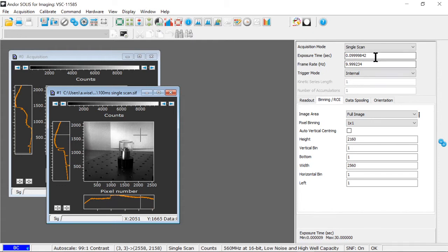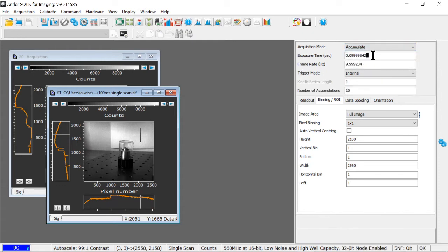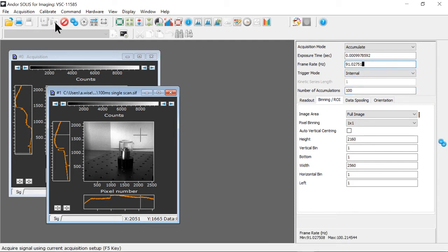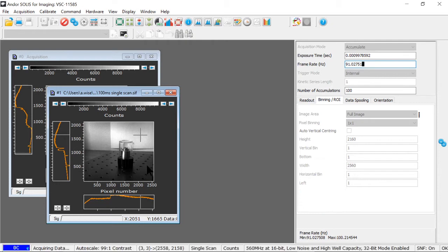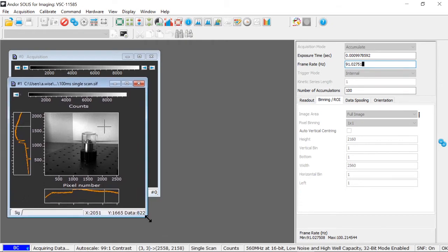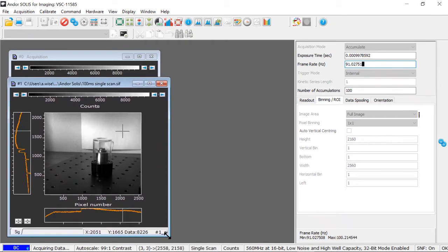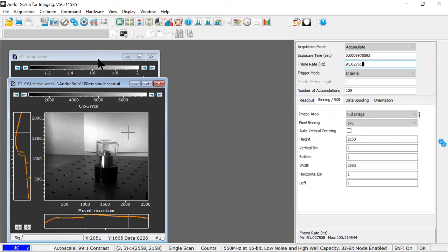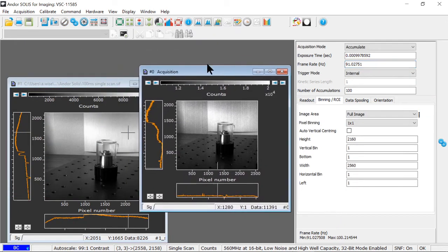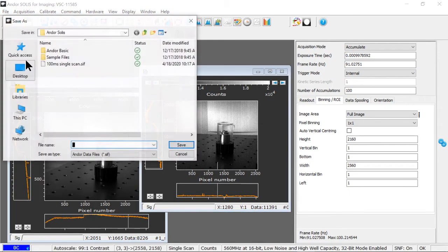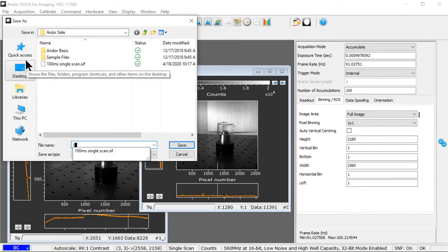Now I'll set up the equivalent exposure time in accumulations. So I'll go back to accumulate mode, put in a one millisecond exposure time, and do 100 one millisecond exposures added together. This overall will take a little bit more time because there's additional readout cycles to be done and those each have some associated overhead. So here's my 100 accumulation image and I'll save this.